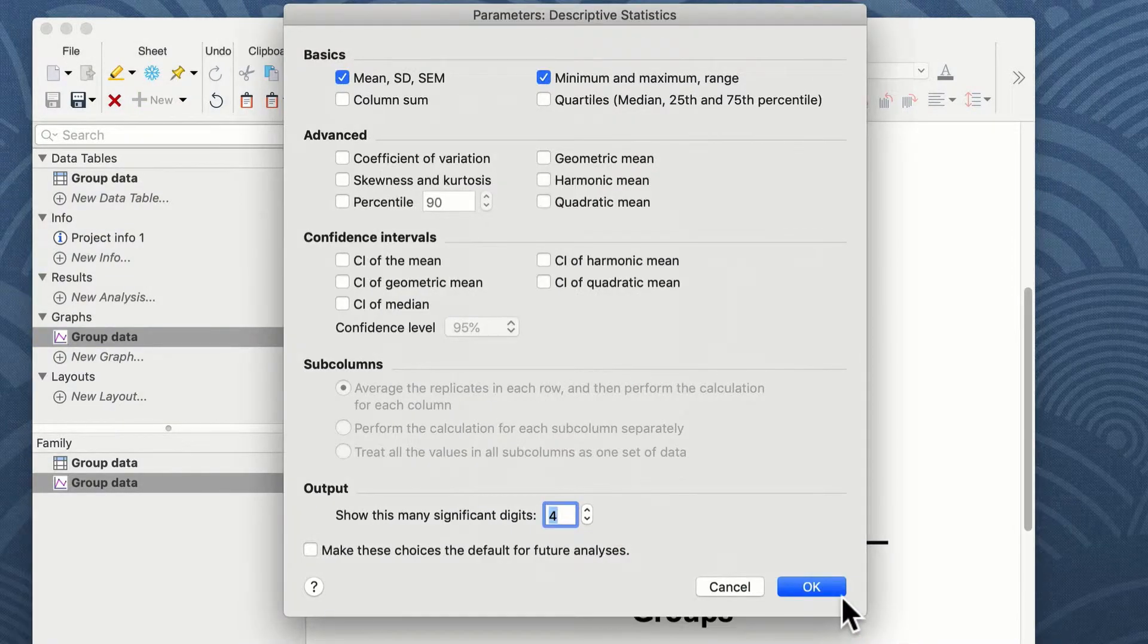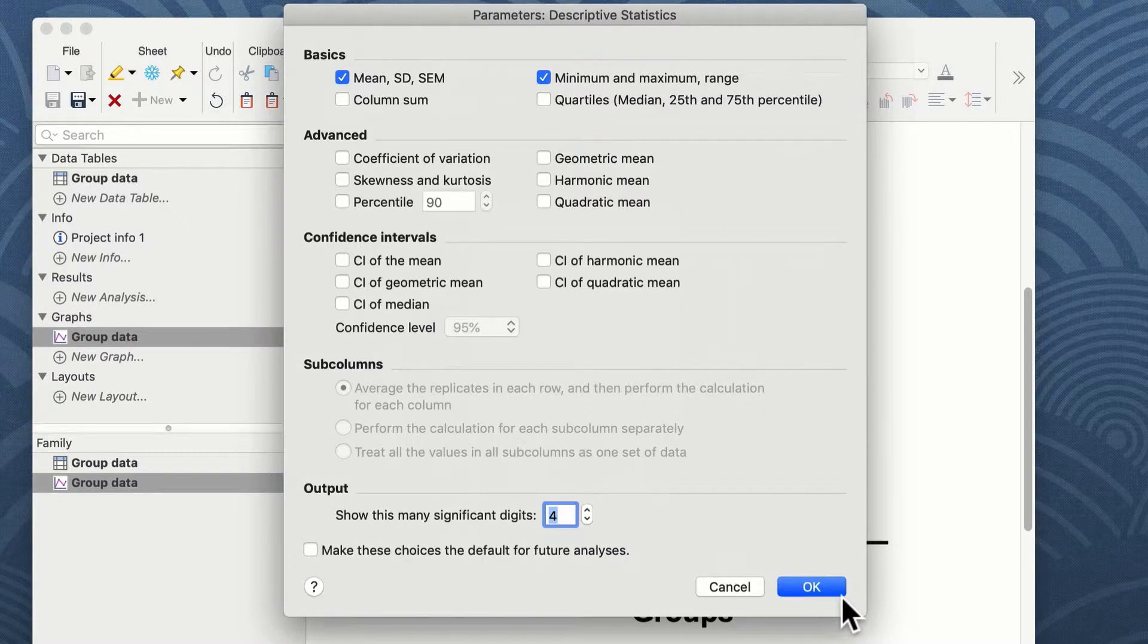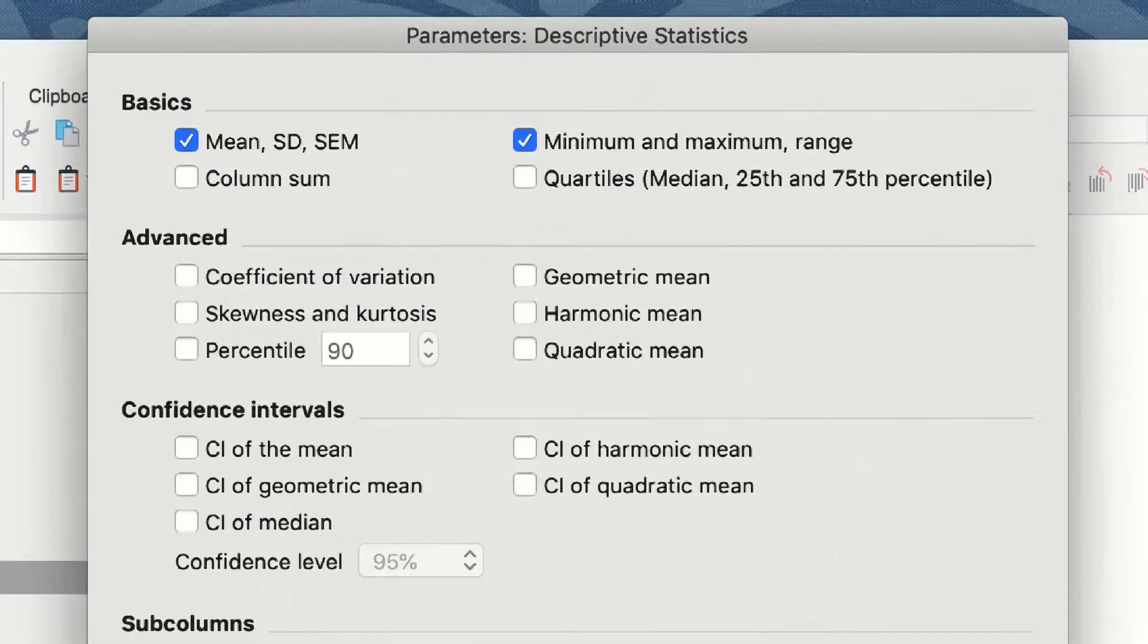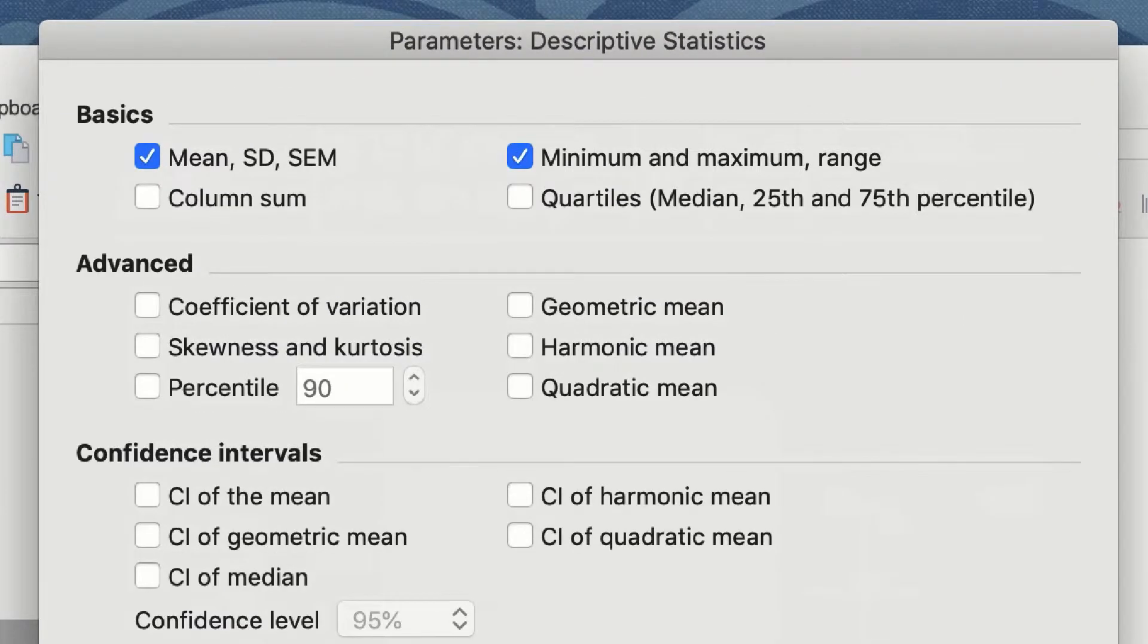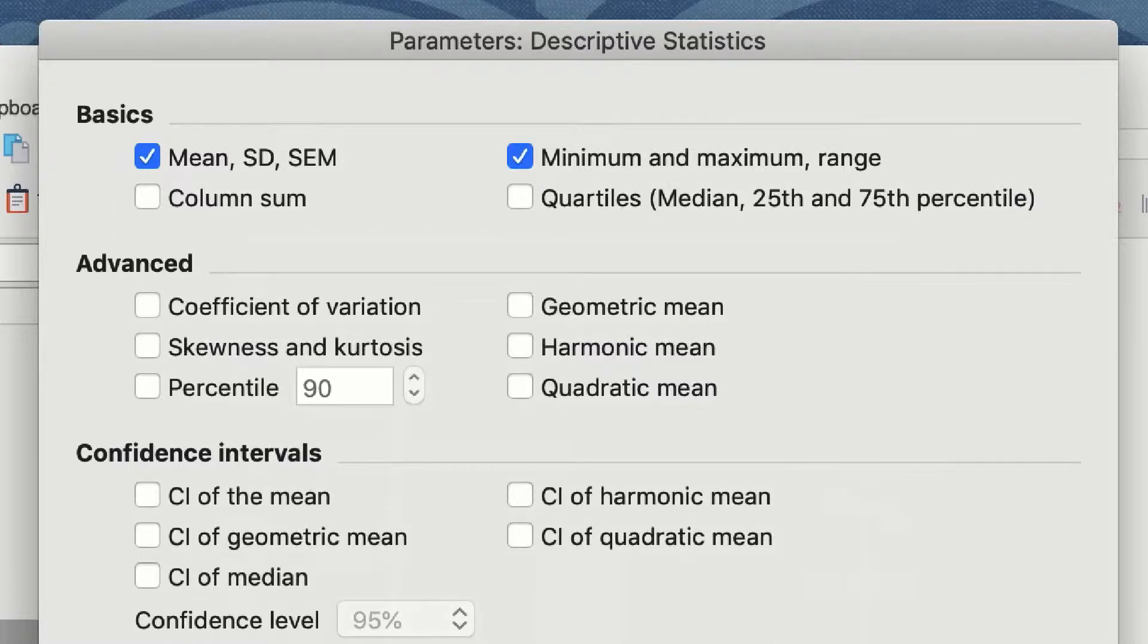The next window that appears are the parameters for your descriptive statistics. Prism offers a wide array of descriptive statistics that you can look at. By default, it highlights the mean, standard deviation, and standard error of the mean, as well as the minimum, maximum, and range of your data.